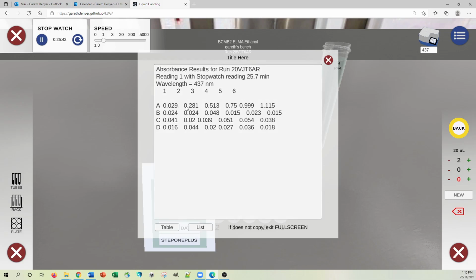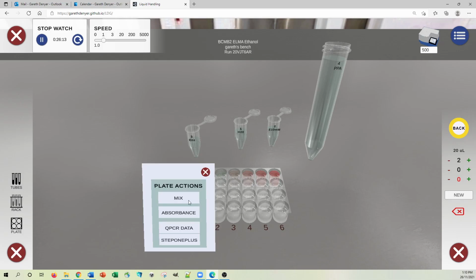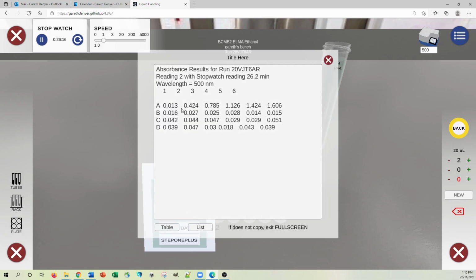Now, if you look along row A, you've got what appears to be quite a nice relationship between the amount of ethanol we put in and the absorbance. That's pretty nice. But one thing to notice is that we're measuring this at 437 nanometers, which isn't the extinction maximum for that. We really want it to be, I think, 500 nanometers. So let's change our plate reader so that it's reading at 500 and see what happens when we do it again. And now we're again getting the same sort of linearity, but this time the absorbances are a bit bigger.